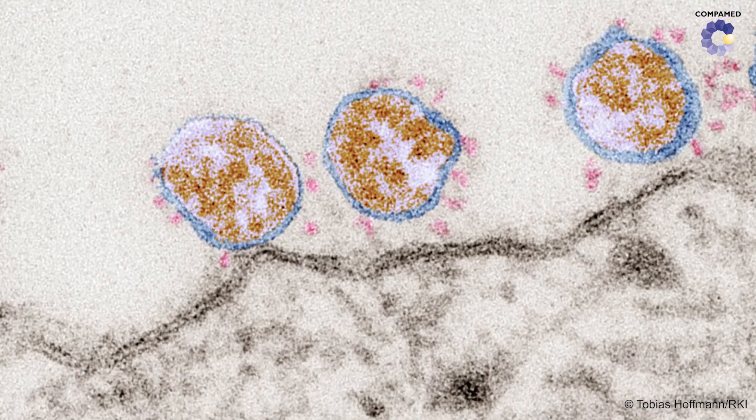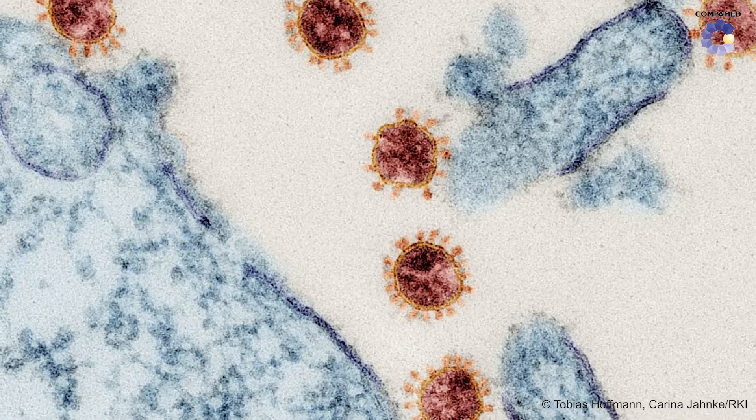Virologist Schindler has a sight set on even broader possibilities for the test platform. We are now planning a project that will allow us to simulate how seasonality affects the inactivity of virus particles in the context of this aerosol test rig. The nasty infectious diseases come in the fall, and as soon as it gets warmer again in the spring, the problem comes to an end from one day to the next. We now want to develop the test box further so that we can also modulate these environmental parameters: humidity, ozone content, and natural solar radiation, which also contains UV light. We want to simulate seasonality, so to speak. I think that's very exciting.